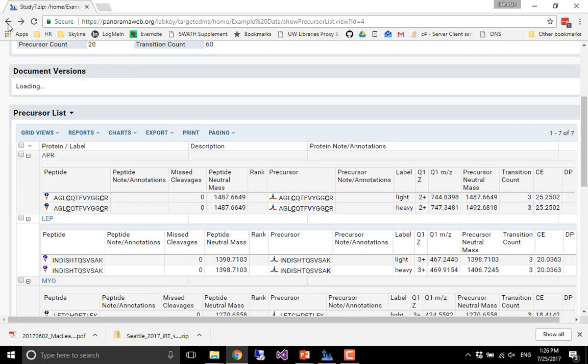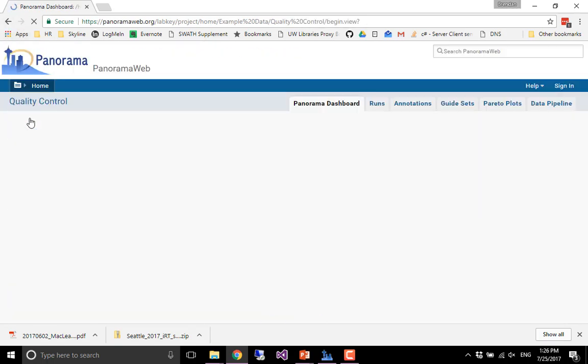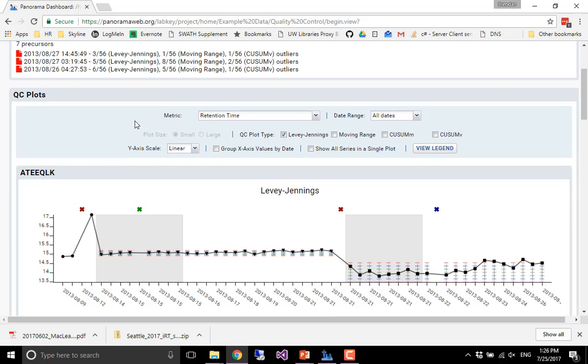And then I'll go ahead and show also one of those QC folders. So this will look a lot like the screenshot in the slide, but here, can everybody see okay? Should I bump up the font a little bit? Steve, look good? Okay.